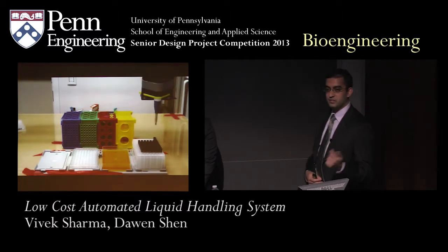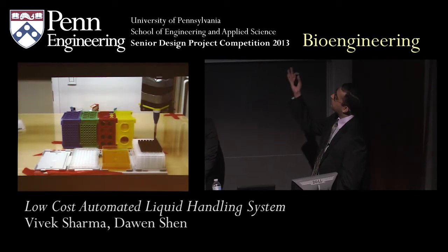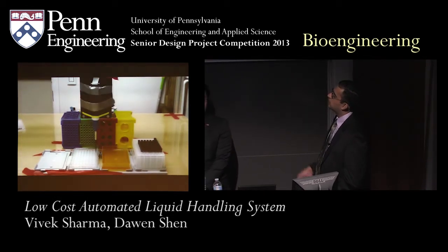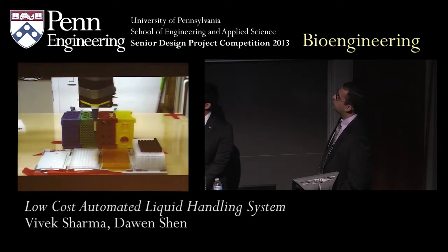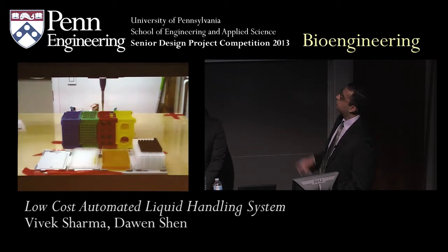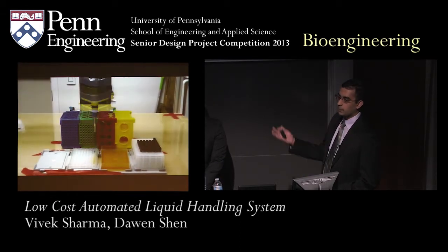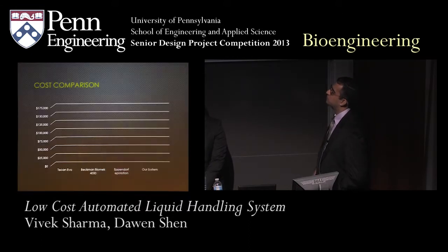We mentioned the system has to be able to accurately load these tips. It detects that one was not loaded, it'll successfully go and mate to a tip. And we're doing a 3x time lapse here roughly, and we're transferring liquid from an open reservoir into this 96-well microplate from also small tubes in the back there, as you can see right now. And the system is transferring liquid. As you can see, the colors are changing in the wells as we go.